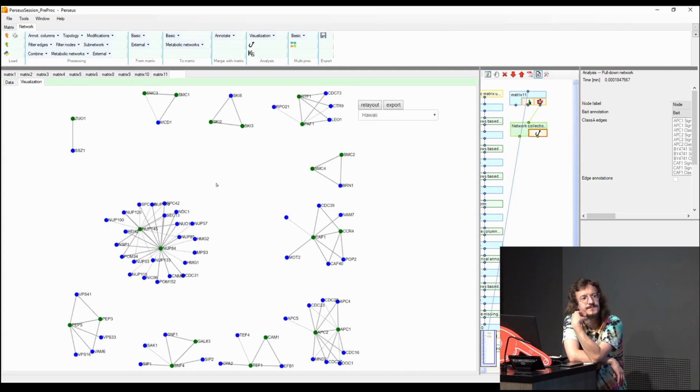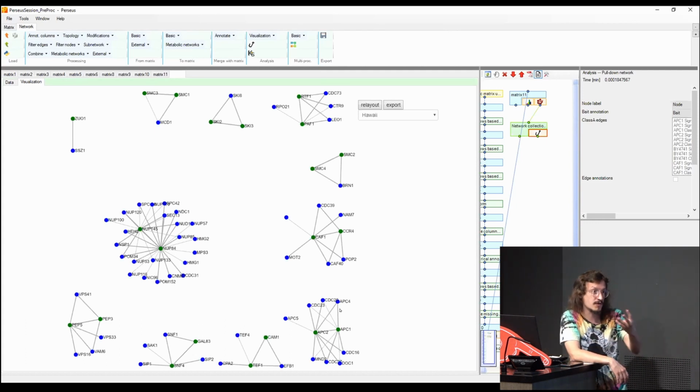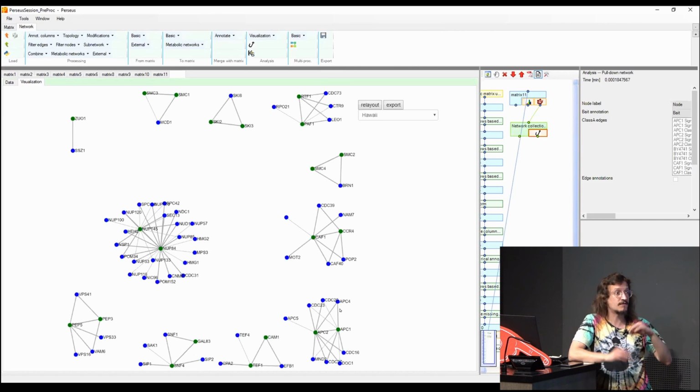Would that be then, when I'm in that situation, maybe not using the complement? Yeah, it depends also on how many experiments you're doing. If you see here, for example, APC1, APC2, they have similar binding proteins, but in this case they had 17 different baits with 4 replicates each. But if you have an experiment with only 2 baits that have similar binding domains, then in that case I would say yes, the complement may work against you.